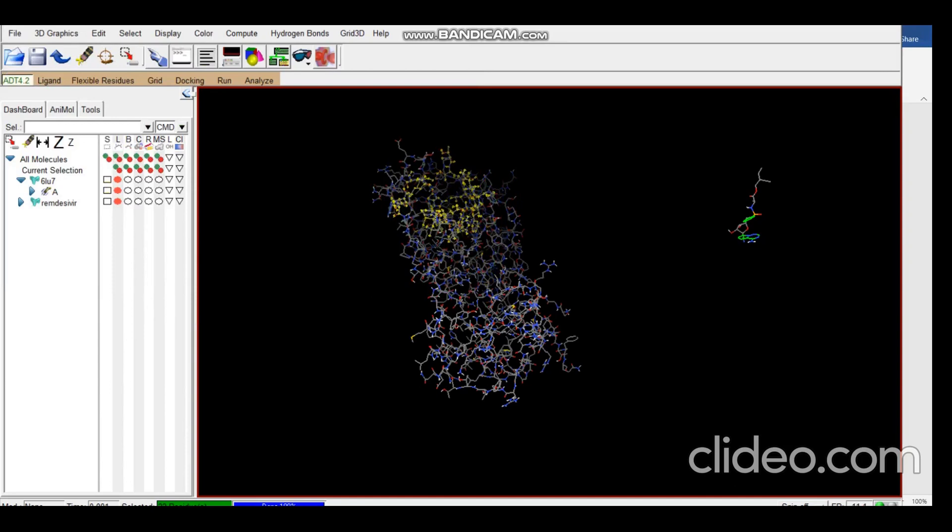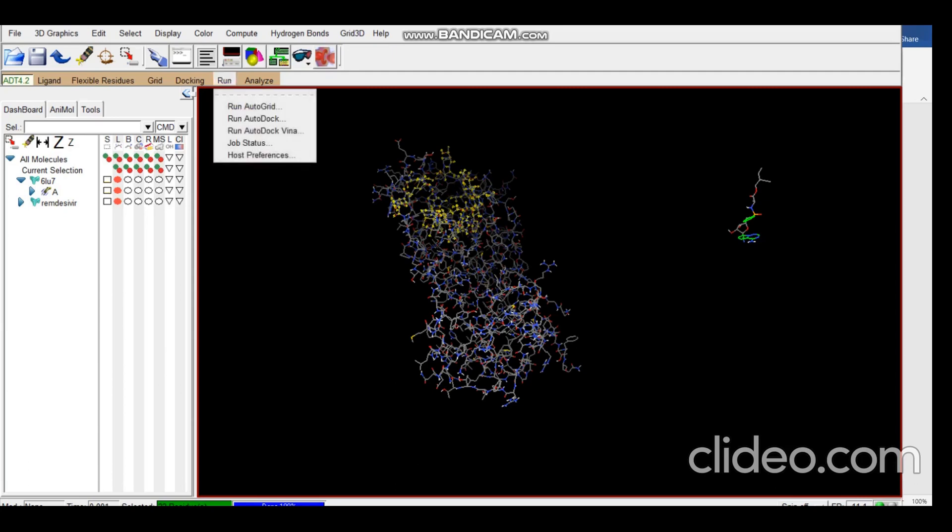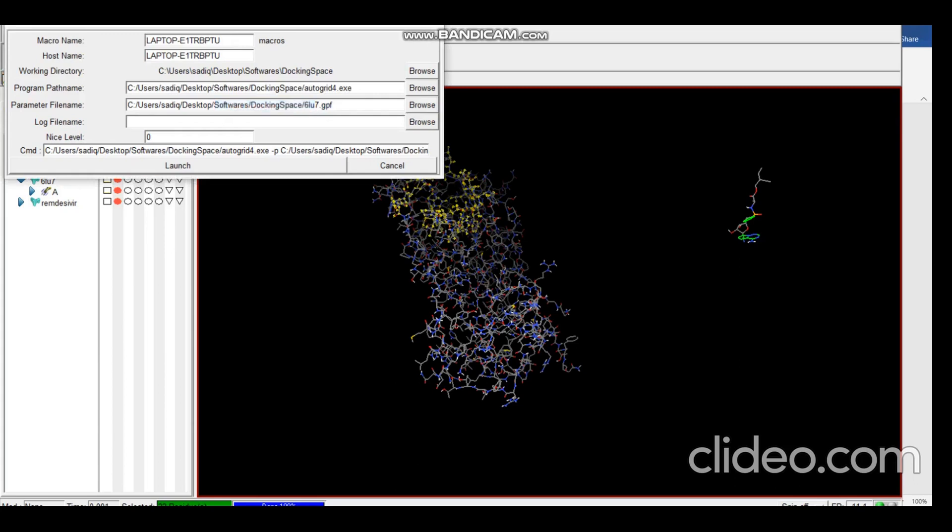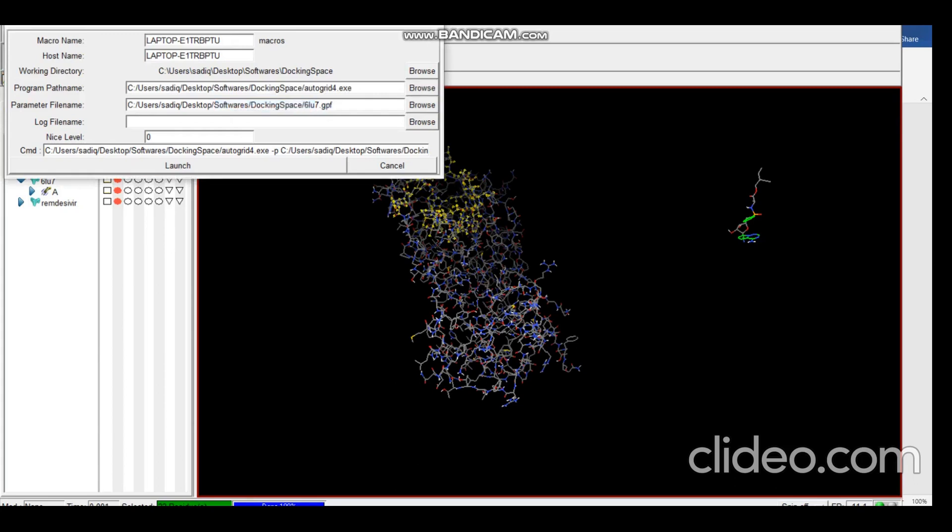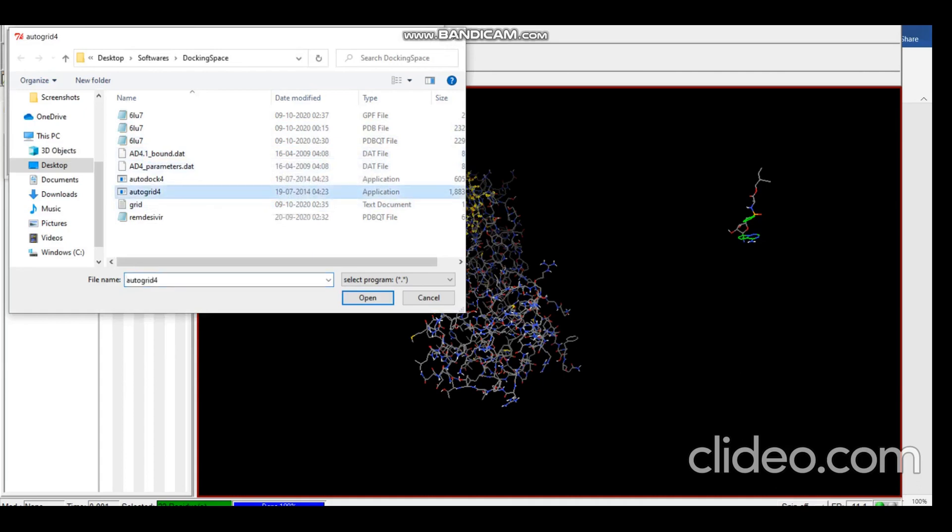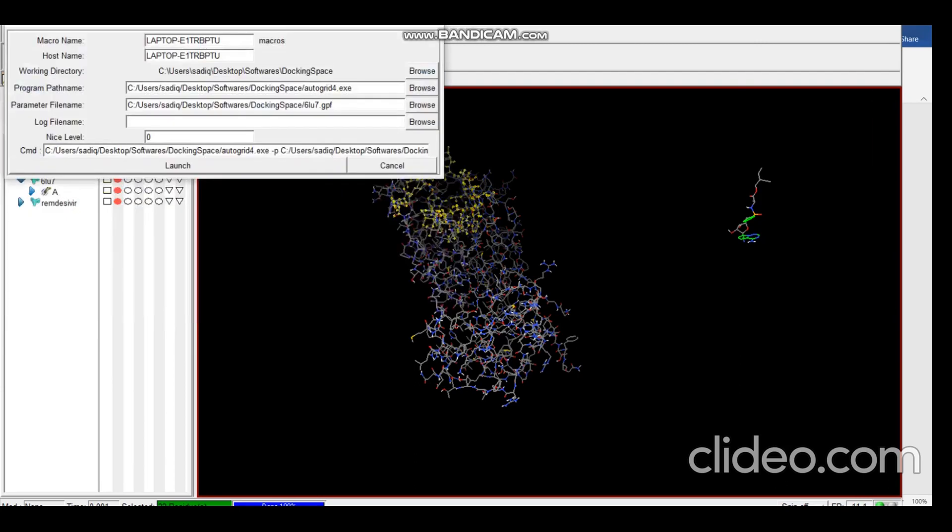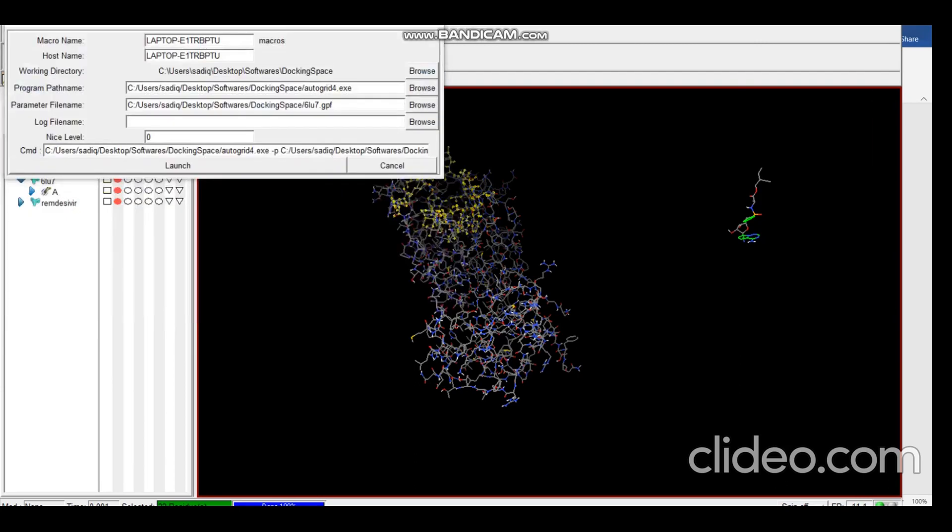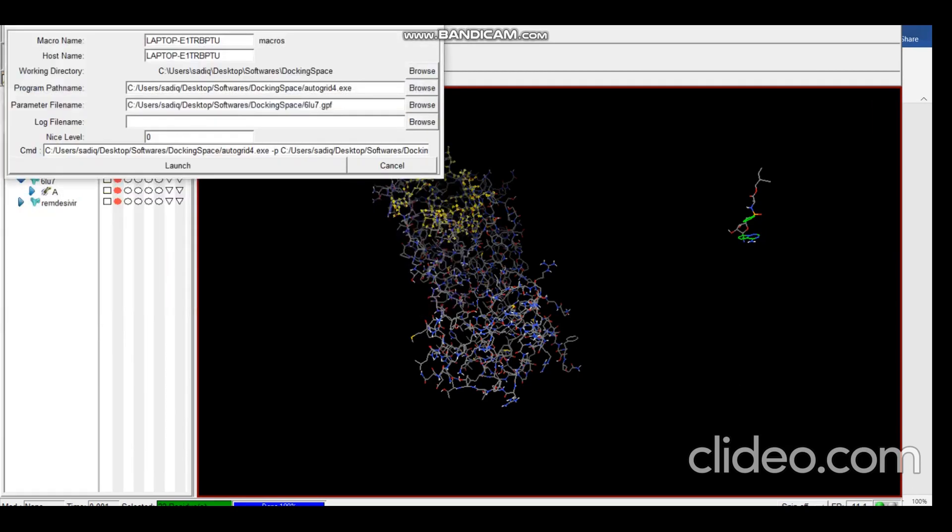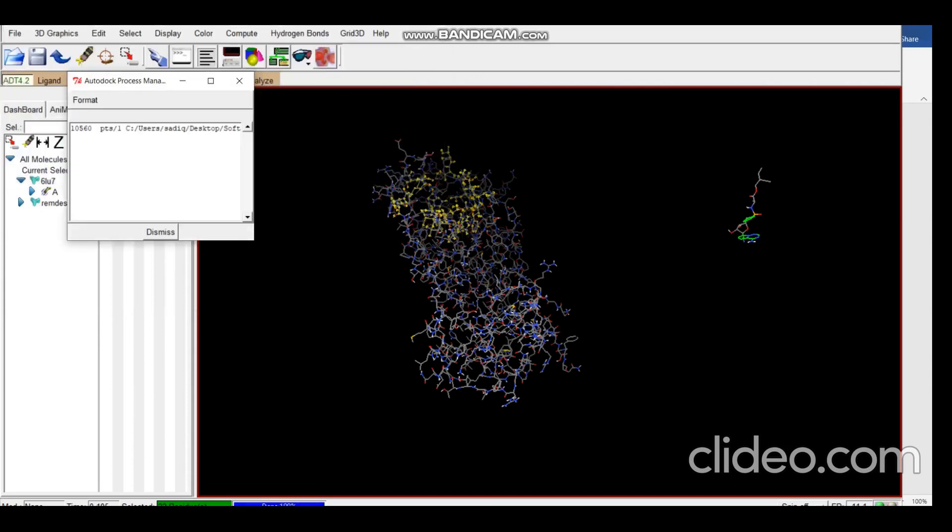So now we have all the necessary files for running AutoGrid. Let's just go to Run AutoGrid. We need to select the program path name, that is autogrid4.exe. This application you'll get when you install AutoDock Tools so you need not worry. Then we select the program parameter file, that is the GPF file, and the log file name is generated automatically, and launch. It takes a few minutes for running AutoGrid.